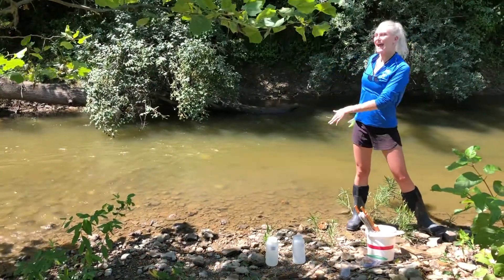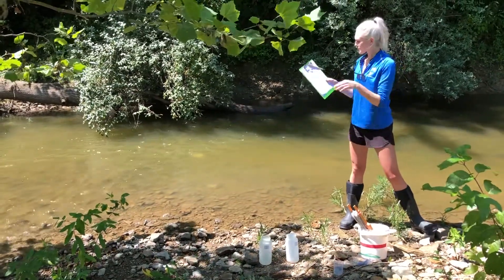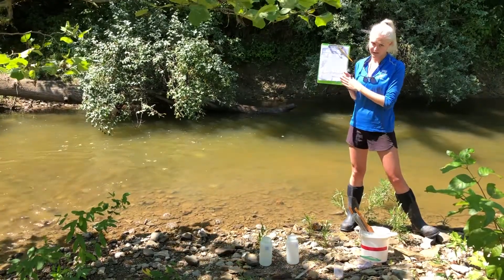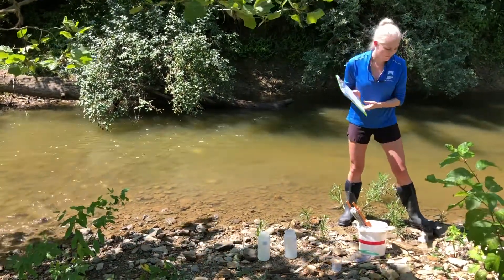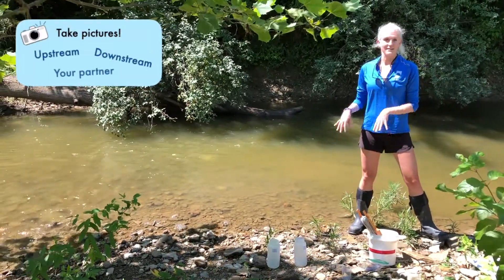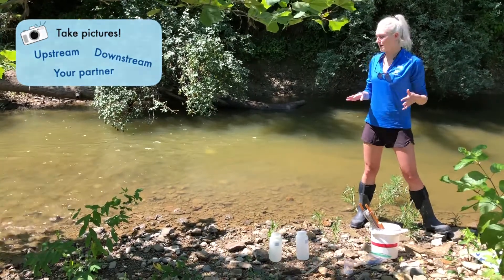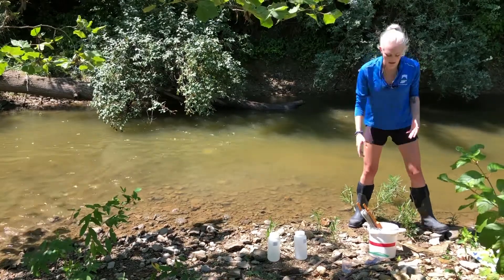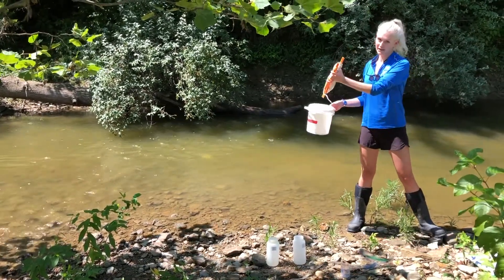We made it. We are ready to actually sample this stream. When you get to site, one person is going to be responsible for filling out the habitat evaluation form — you will be provided with walkthroughs on how to fill that out. Our other person is going to go ahead and take the physical water samples. It's important to remember not every site you can access by just walking down, and in those cases it's perfectly okay to take a rope and a bucket and sample over the side of a bridge.